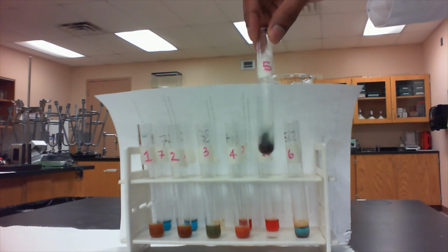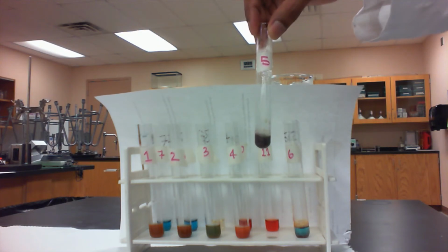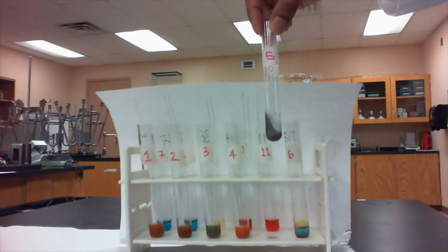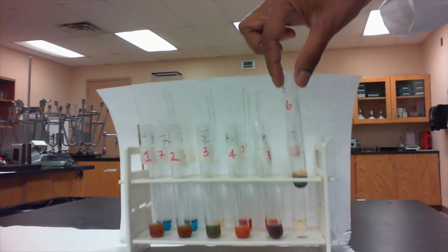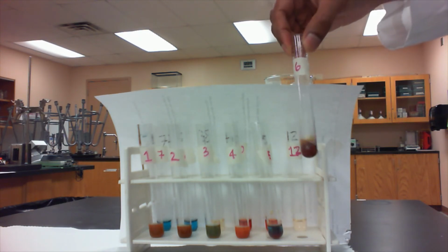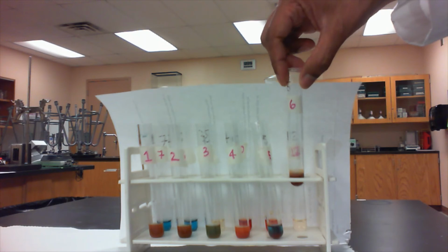If I shake this up here to sort of get all the solid particulates distributed evenly, you can see the color. It's a really dark, I know it's kind of difficult to see, but it's a really dark red color associated with it. Same thing for test tube 6, right? All the solid here has fallen to the bottom. If I shake it up and agitate it, you can see it's got a nice dark red color associated with it.